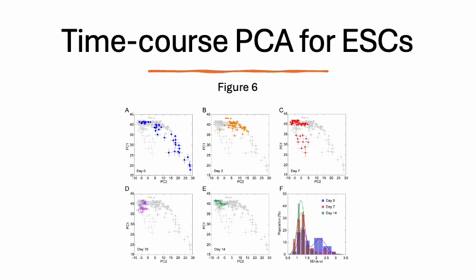By day 3 and 7, the PCA plot shows many cells beginning to drift towards new areas in PC space, which suggests that their nuclear biochemistry has started to change. And these changes might include shifts in peaks related to the amide 1 band or the cytochrome C, which could reflect chromatin being reorganized or protein expression being altered as genes involved in differentiation begin to activate.